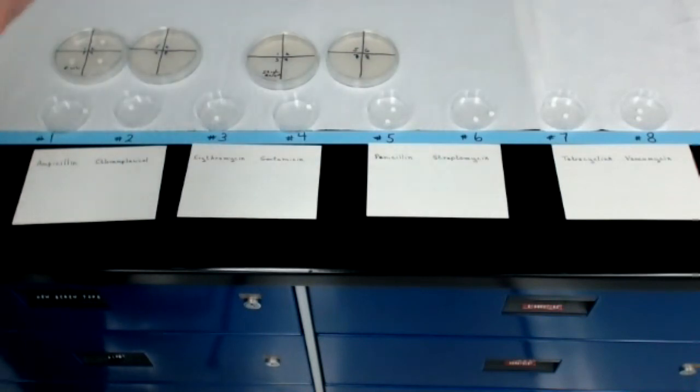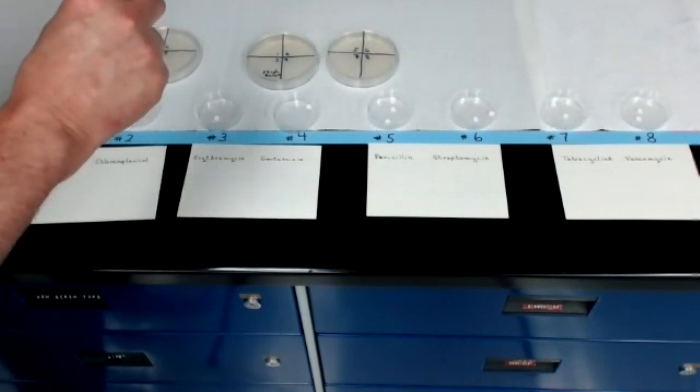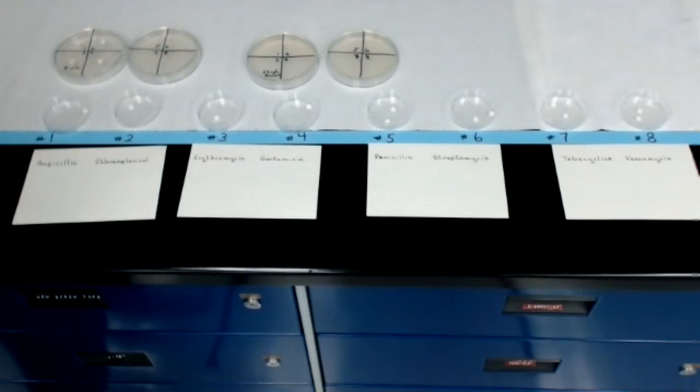What we will be able to do is compare the sensitivity of E. coli to each of the 8 antibiotics, and also compare the sensitivity of Staph aureus to each of the 8 antibiotics. What we will do with these plates after I finish putting the discs on all of the quadrants is we'll put the plates in a 37-degree incubator and let them grow overnight.